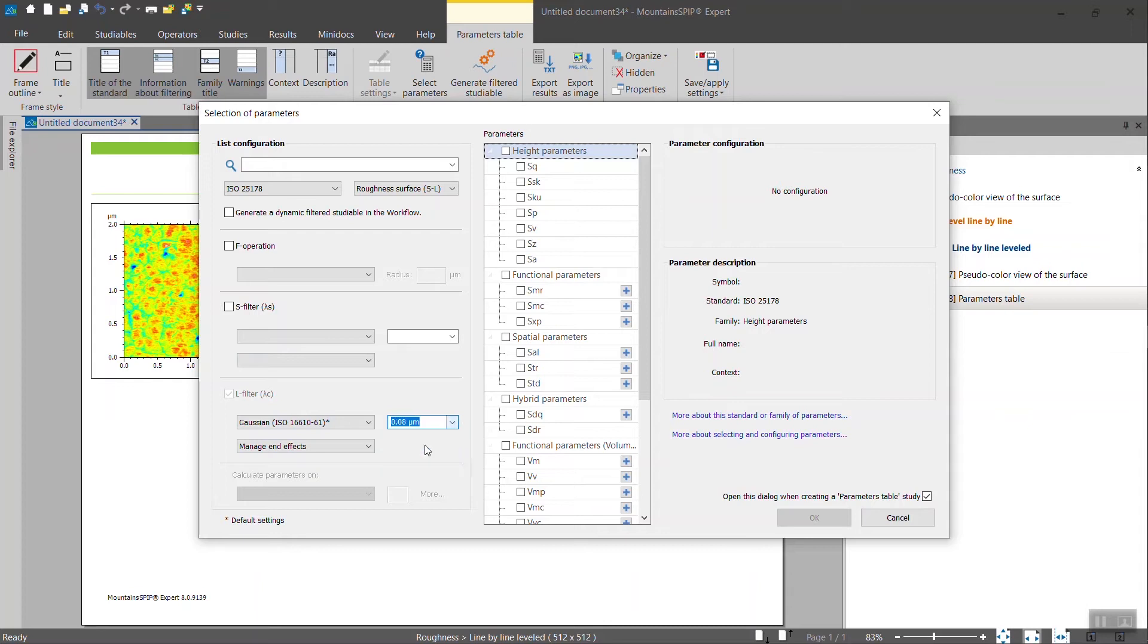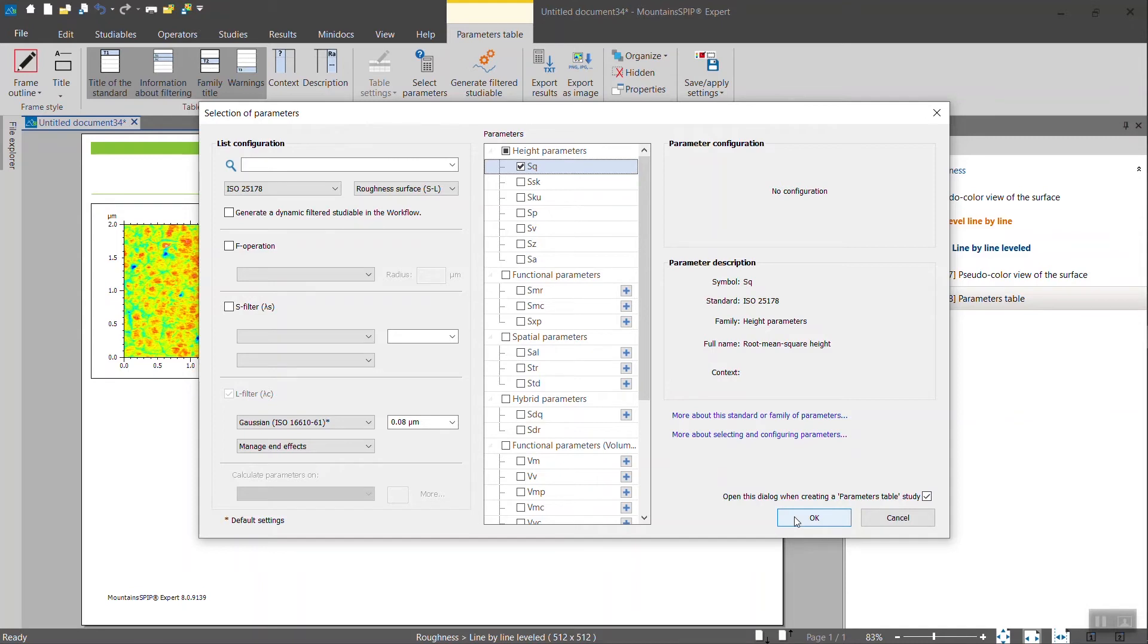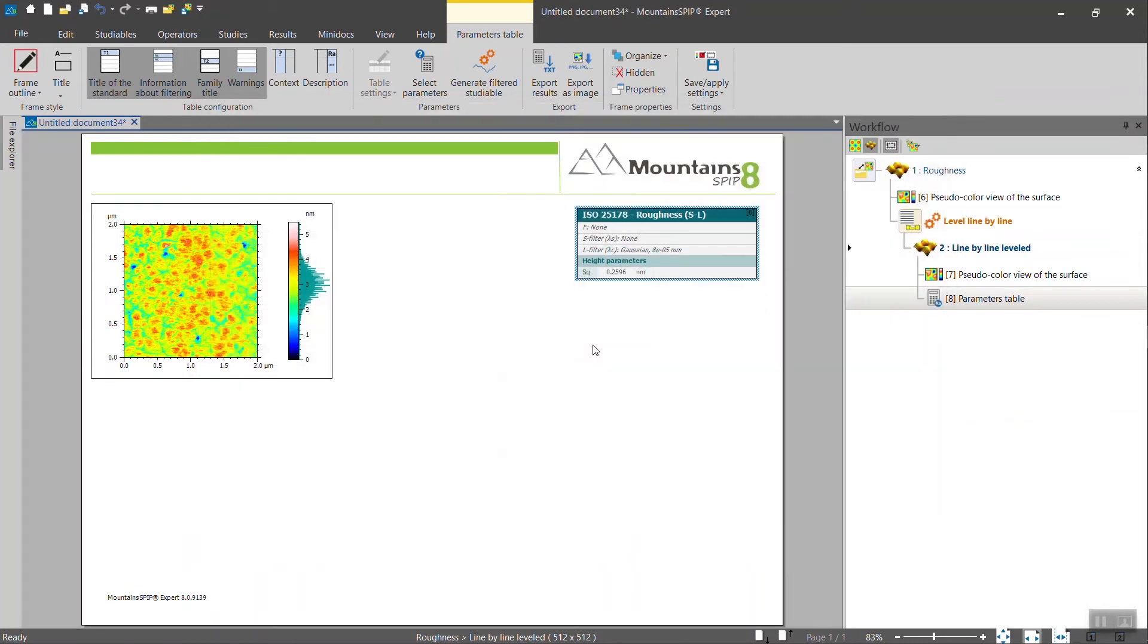You may change the cutoff value. And then when you are happy with the number of parameters you want to calculate, click on OK.